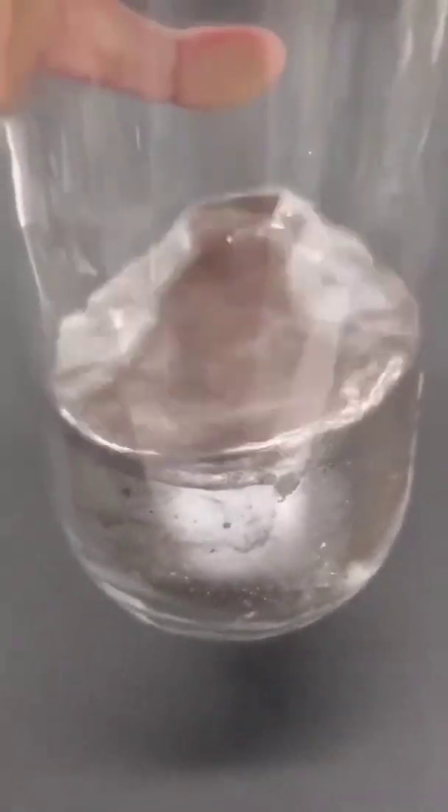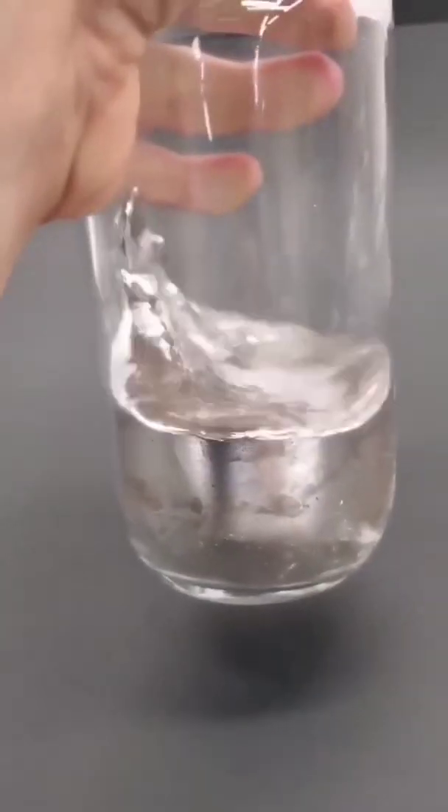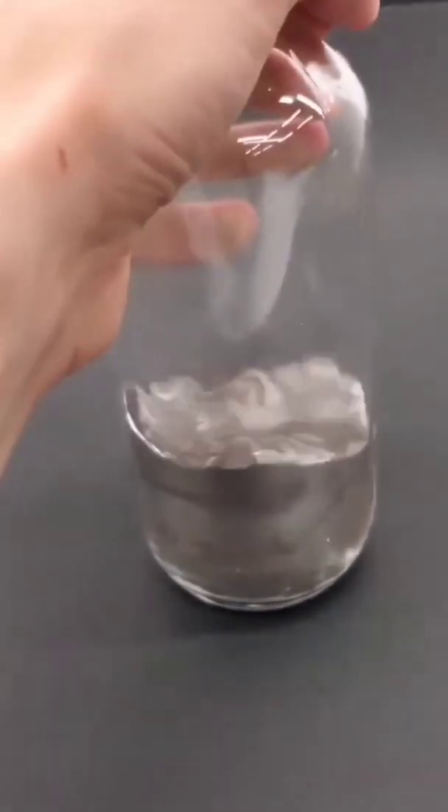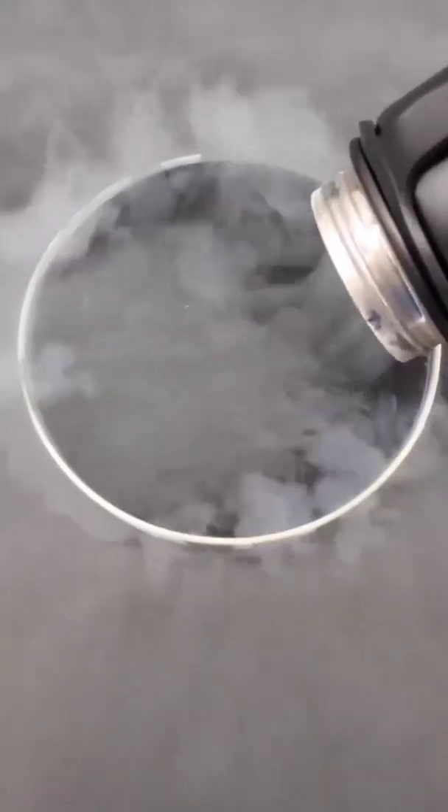Mercury is the only metal that's a liquid at room temperature, and something that I've always wanted to do was to try making it solid. To do this, I just have to add some liquid nitrogen to a dish, and wait for it all to cool down.